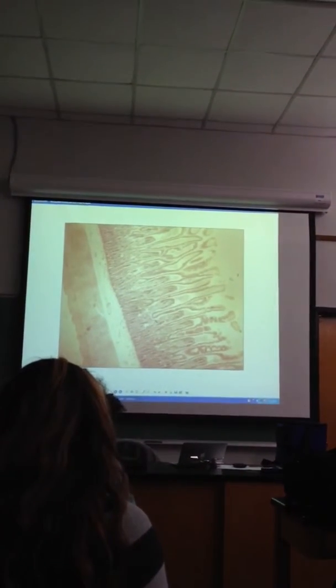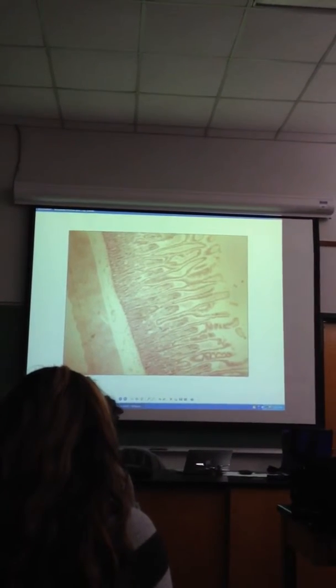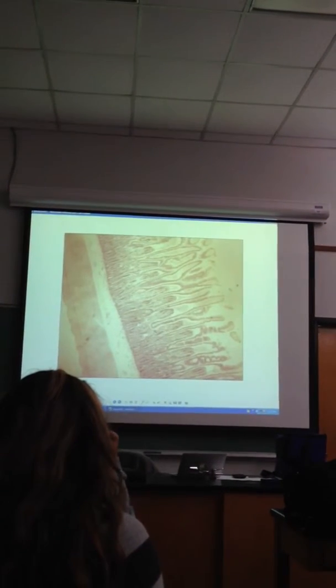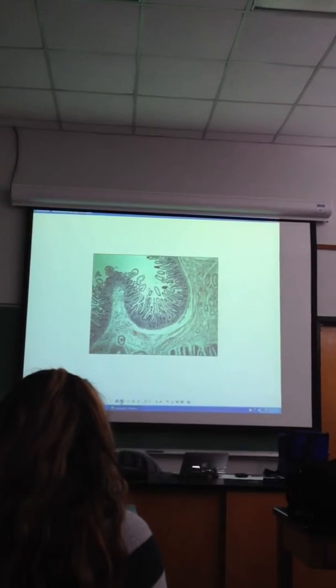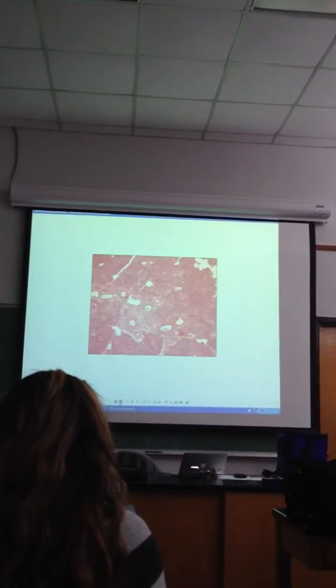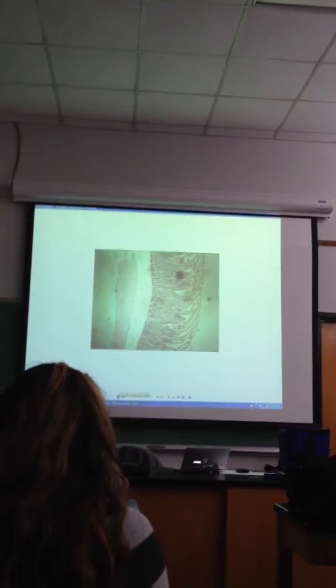Do you have to call it jejunum? No, you don't. I'm not looking for you to do that. So when you tell me small intestine, okay? Now this isn't the only area of the small intestine that's in the set. If you look at other areas, here's the duodenum.